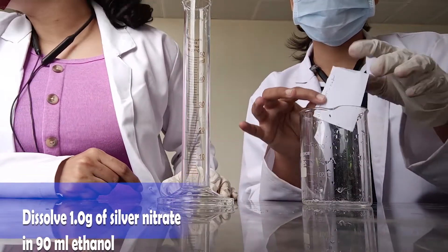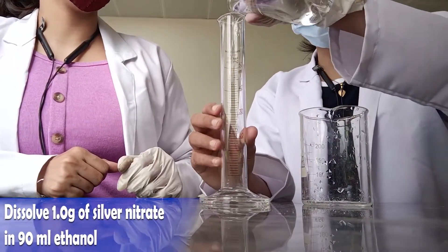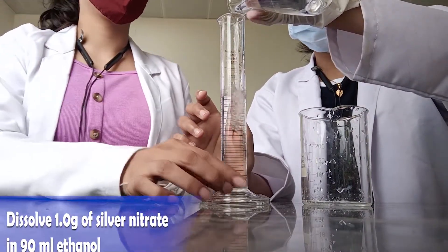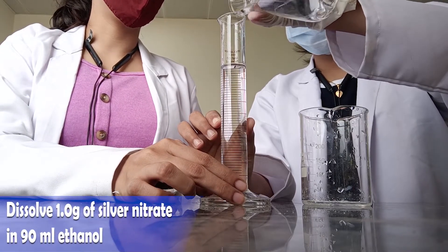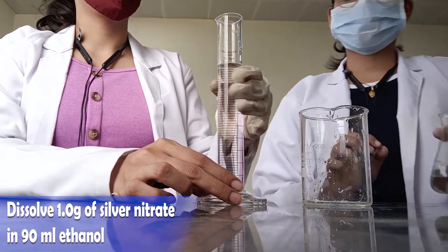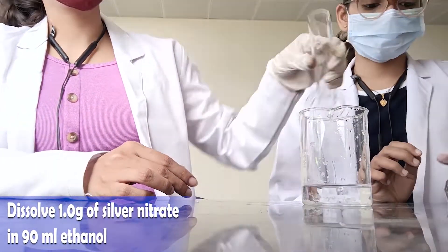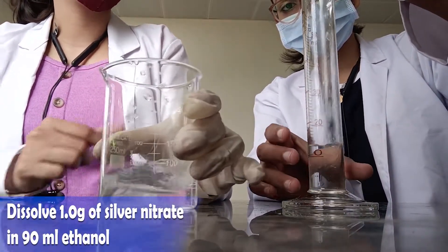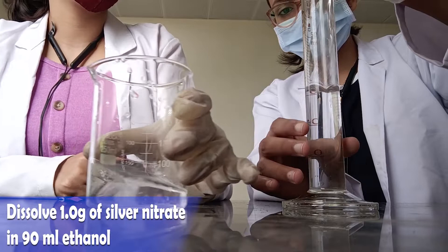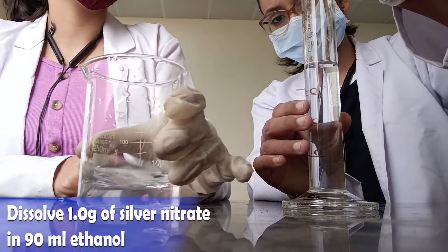Take a beaker and take 90 ml of ethanol, and mix one gram of silver nitrate in it. I am taking 90 ml of ethanol in the measuring cylinder — 50 ml is taken in the first turn and the remaining 40 ml is taken in the next turn.